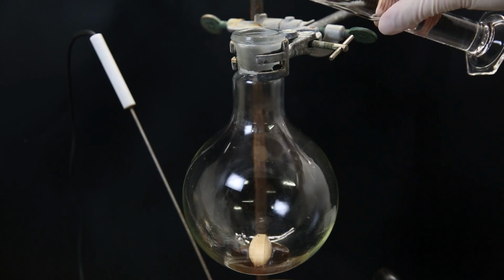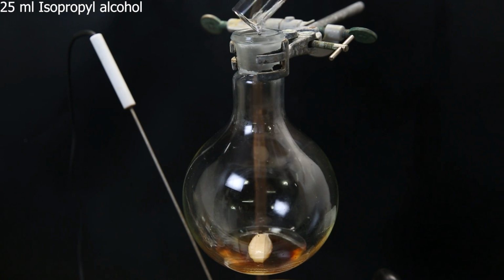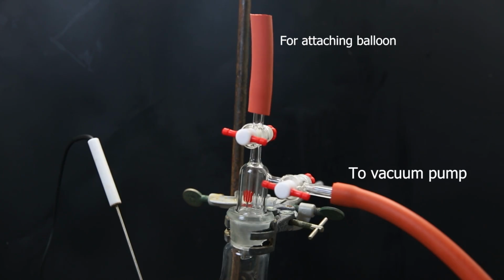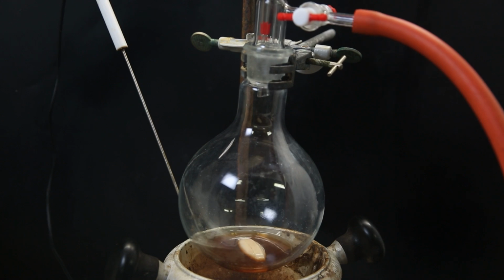Now for the next reaction, to this oil I add 25 ml of isopropyl alcohol as a solvent. I then attach a two-way gas adapter to perform a hydrogenation. The right connection leads to a vacuum pump, while to the upper connection, a balloon filled with gas can be attached. I first remove all of the air by opening the way to the vacuum pump, and then close it again, which leaves a vacuum in the flask.